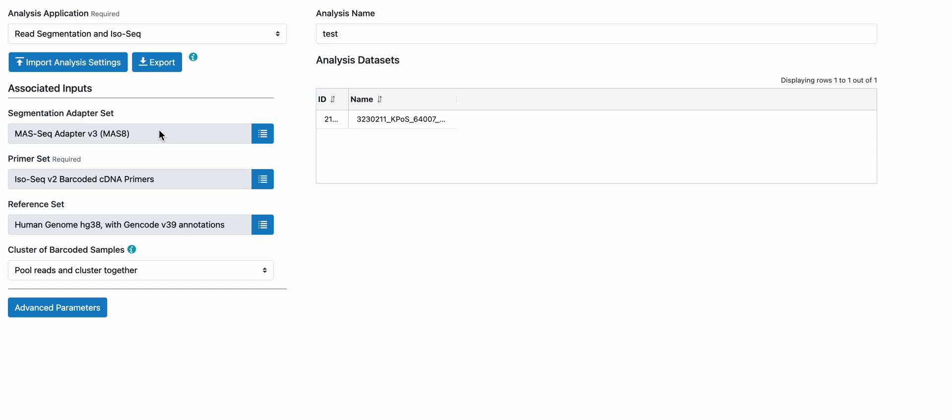The reference set is preloaded to HG38 with Gencode 39 annotations. The other preloaded reference set that comes with annotations in SmartLink is the mouse genome and annotation.